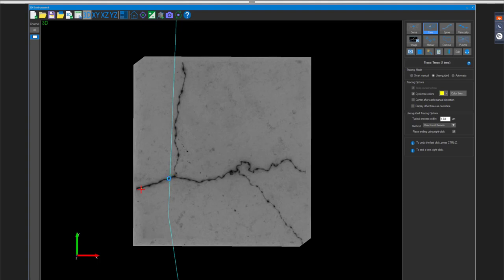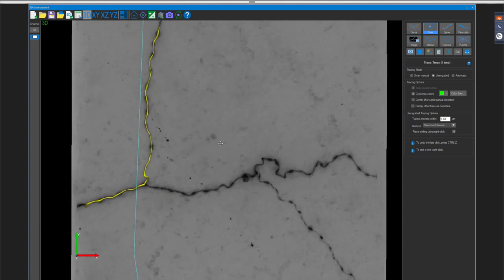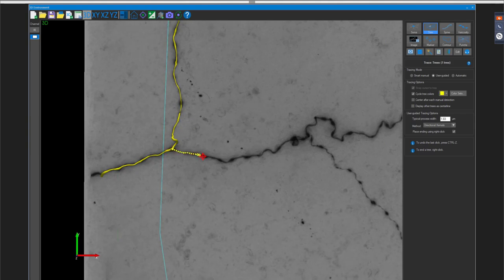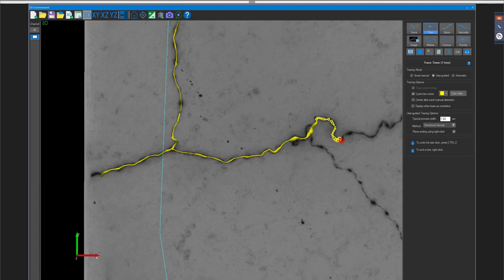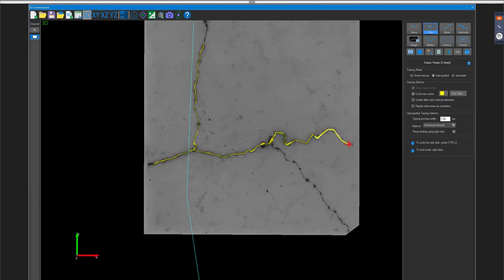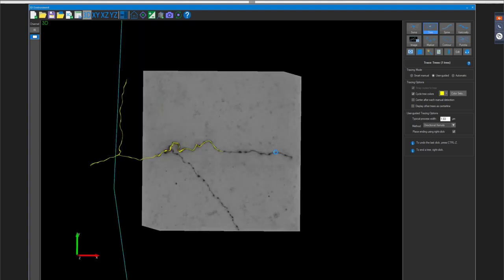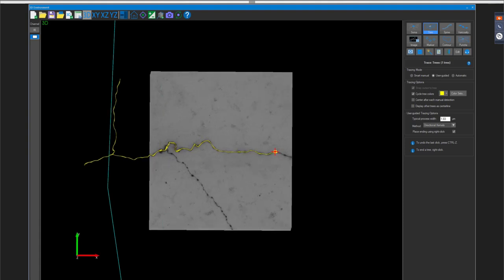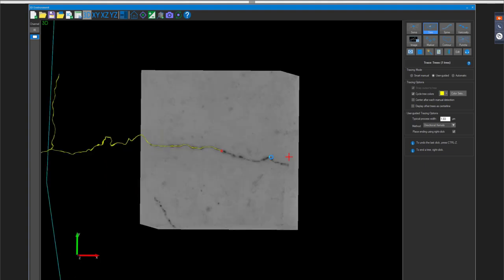From within the sub volume, TJ traces using user-guided mode, right-clicking to zoom in and create bifurcations, continuing to trace normally. He notes that as he reaches the edge of the sub volume, the program automatically generates a new sub volume of the same size and smoothly transitions it as tracing continues.